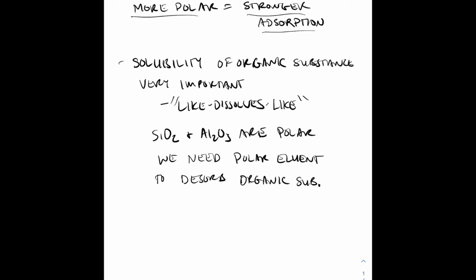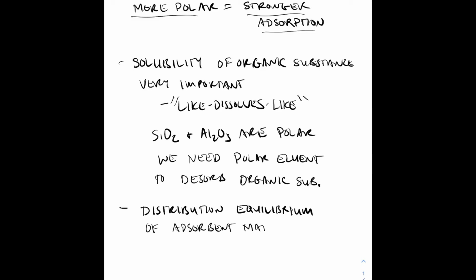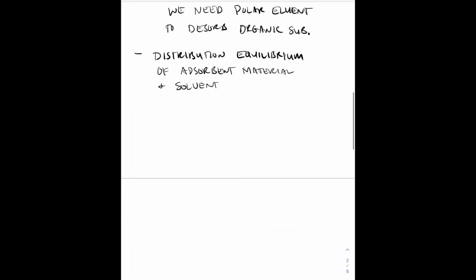And so this is going to be something called a distribution equilibrium. It's a distribution equilibrium of the adsorbent material and the solvent. Okay, and so what do we mean by that?